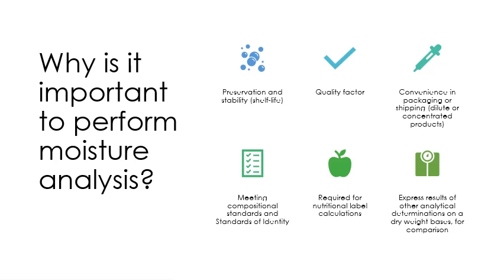In some cases, for convenience in packaging or shipping, your food product may need to be diluted or concentrated, so to determine that, you need to perform moisture analysis. By measuring moisture, you'll also know whether your product meets the compositional standards and standards of identity.